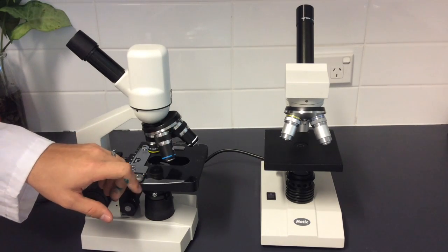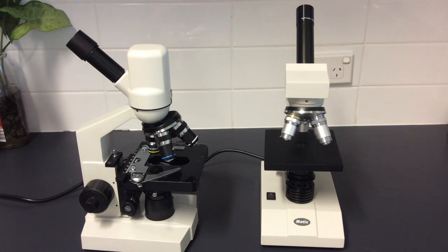You've got an arm which holds the slide in place and then you've got two knobs. These knobs are used to bring an object into focus and also to sharpen the image.